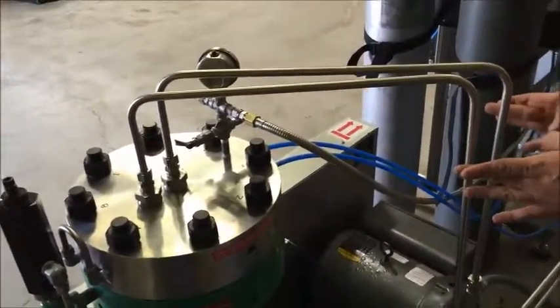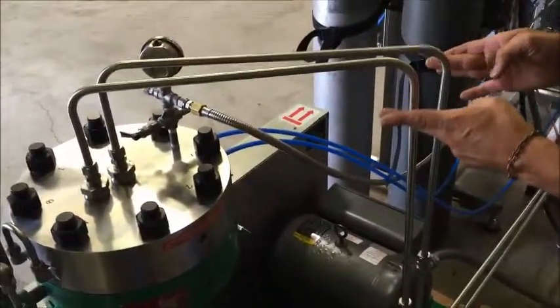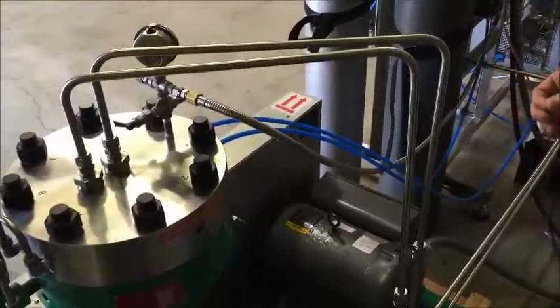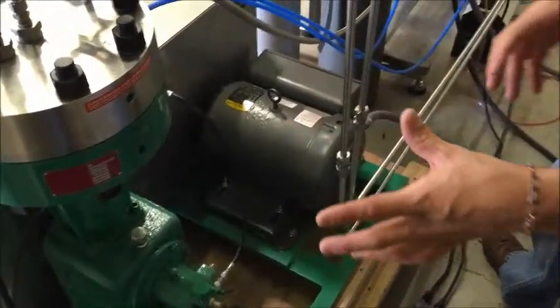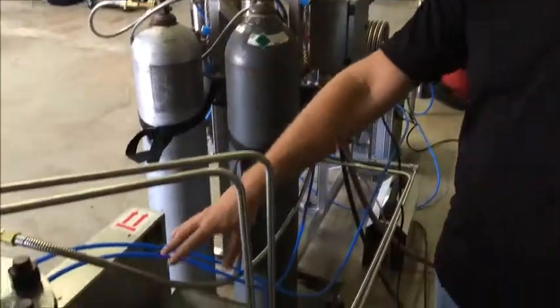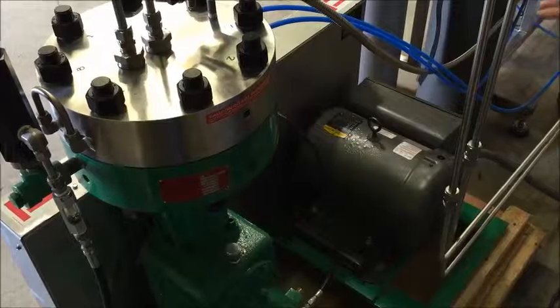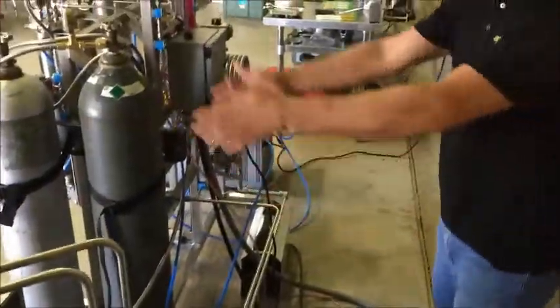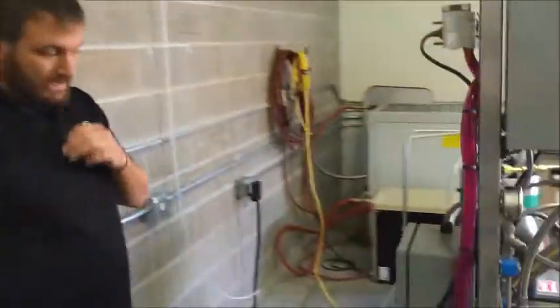One reason we recommend having the CO2 bottles close to the machine or right behind it is so we don't have such long gas pipes. During recovery, we can only pull everything down to about 100 PSI — so the longer these tubes are, the more leftover gas is going to be in the system and you're wasting CO2. People always ask if they can put the compressor in another room — they could, but keep in mind the pipes would be so long they'd be wasting a lot of CO2. As you can see, this isn't that loud, it doesn't put off a lot of heat, and it's really not hot to the touch.